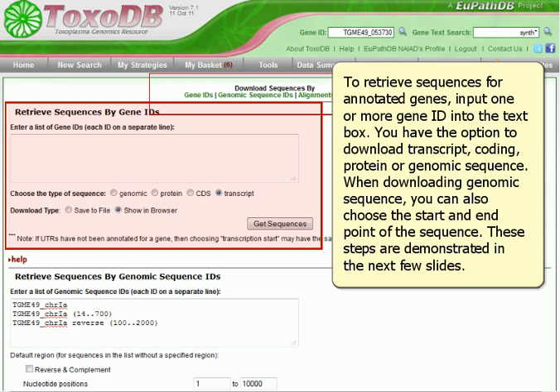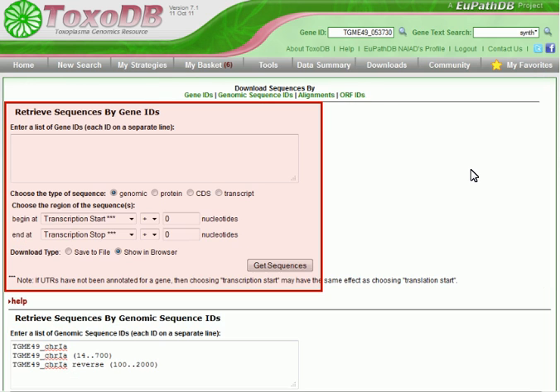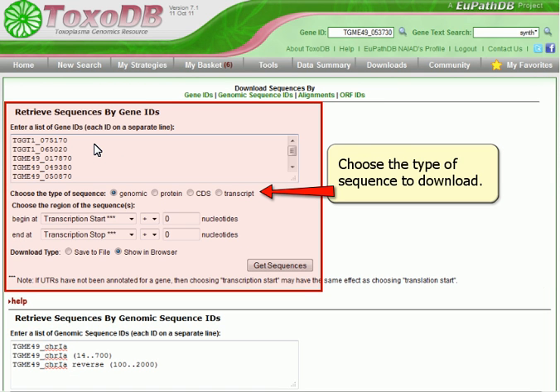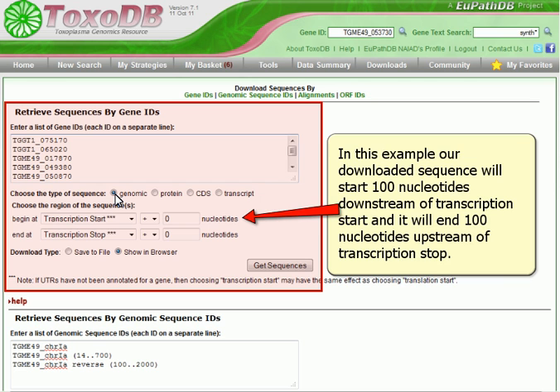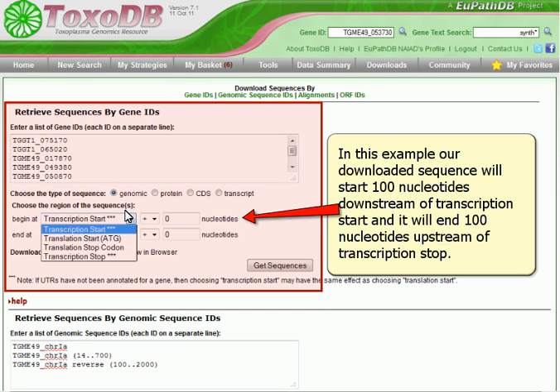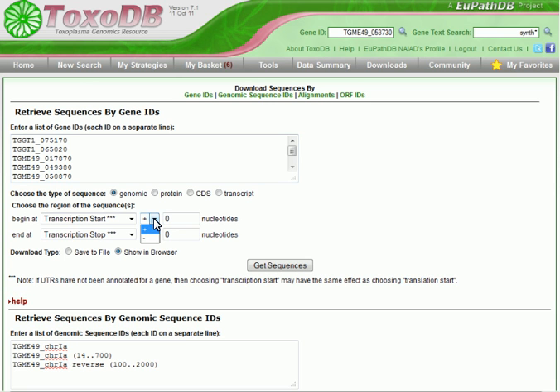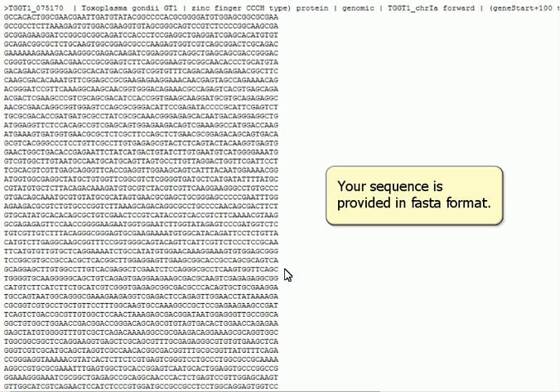These steps are demonstrated in the next few slides. Input the GeneIDs and choose the type of sequence to download. In this example, our downloaded sequence will start 100 nucleotides downstream of transcription start and will end 100 nucleotides upstream of transcription stop. Your sequence is provided in FASTA format.